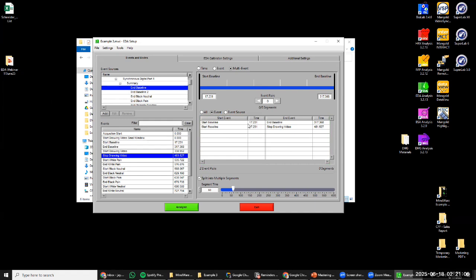So I think the question was based off 20 and 60-second segments. But they do share some time, right? That's occurring here. So if we want that, then that's great. But otherwise, we'll probably want to look at the analysis in a slightly different way.